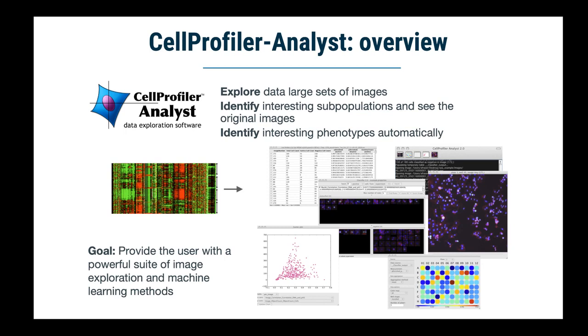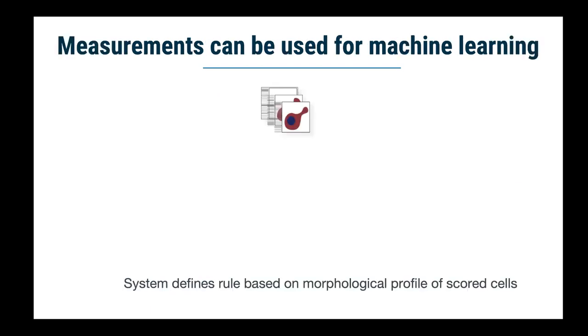But the part that I think will be most new to people and most interesting, where CellProfiler-Analyst makes something that is technically quite challenging very easy, is the classifier tool and the ability to do machine learning. So if we've generated enough measurements ahead of time of our cells, we can imagine that all of these measurements are associated with every cell in CellProfiler-Analyst as these little gray lines that you can see here next to each cell's picture.